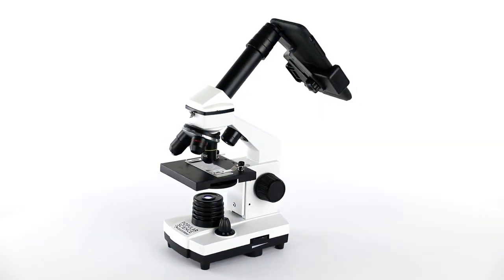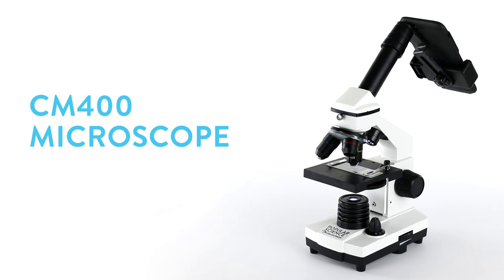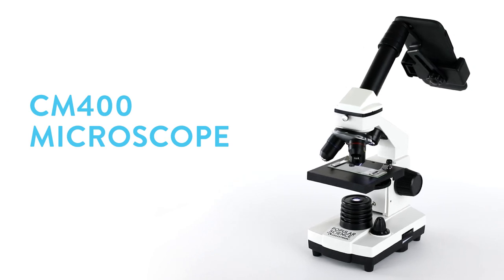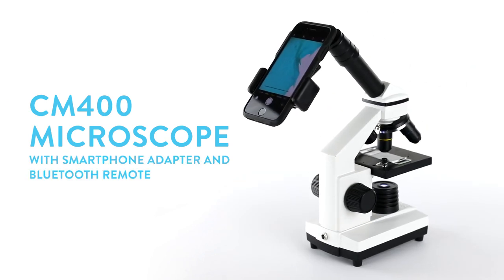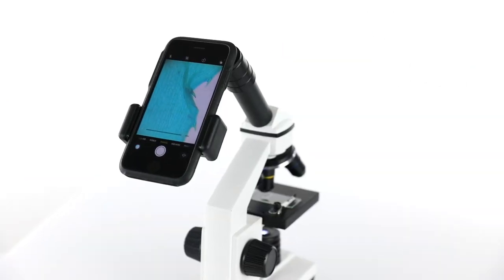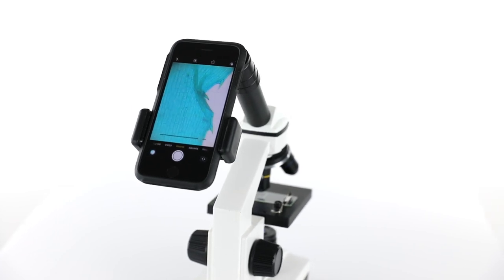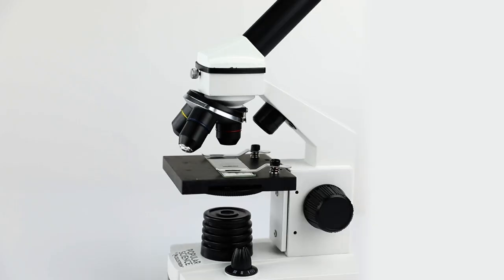Introducing the Popular Science Celestron Labs CM400 Microscope with Smartphone Adapter and Bluetooth. A complete microscope and digital imaging kit, perfect for any classroom or lab.